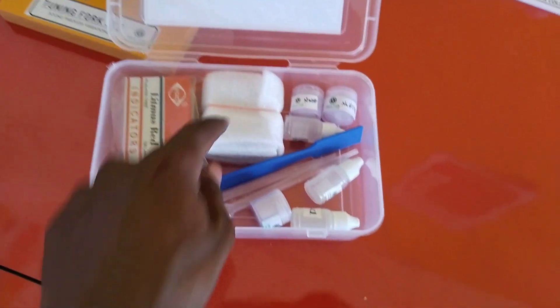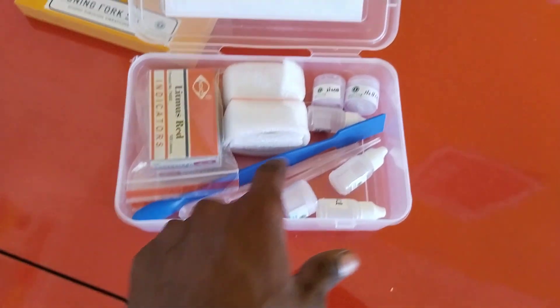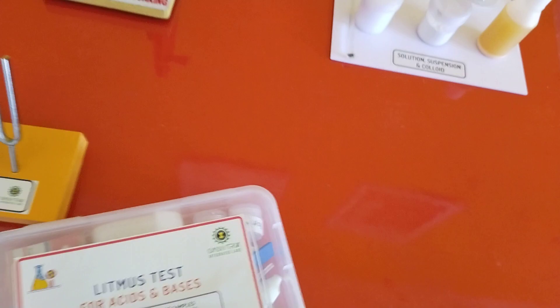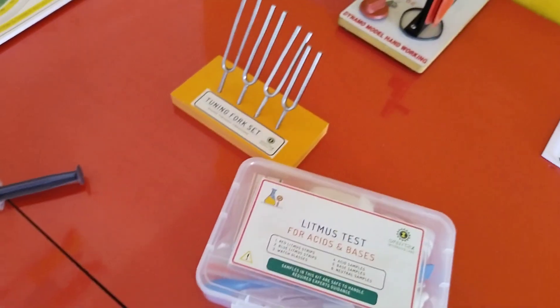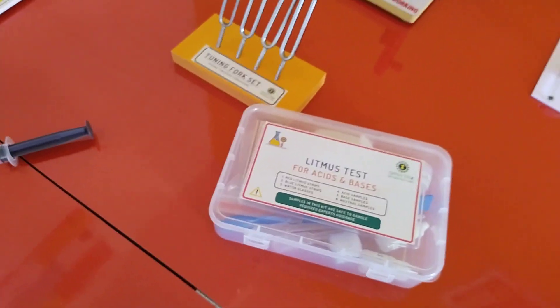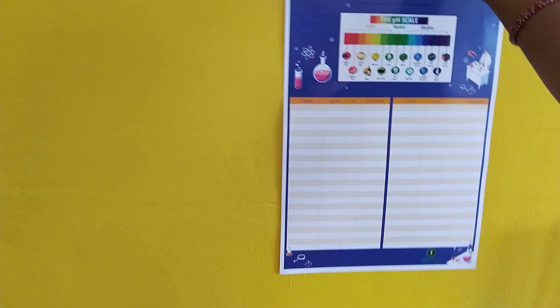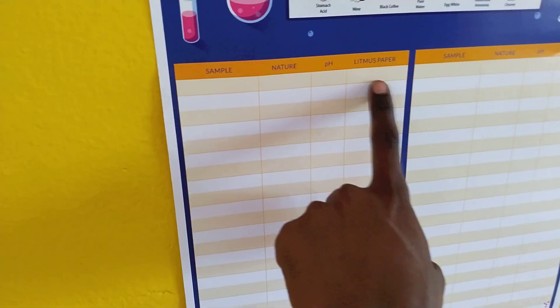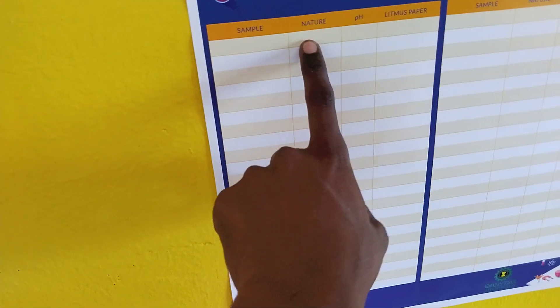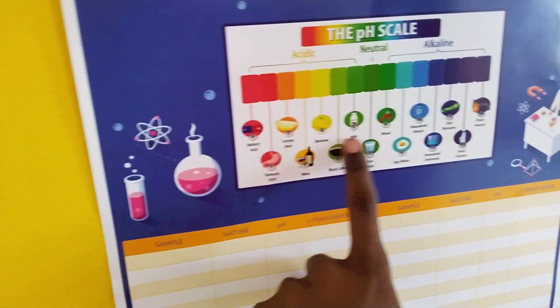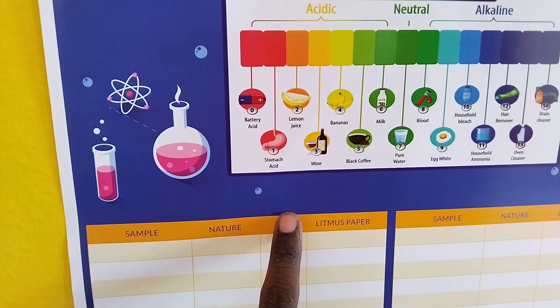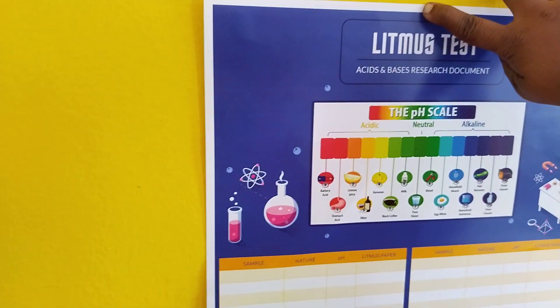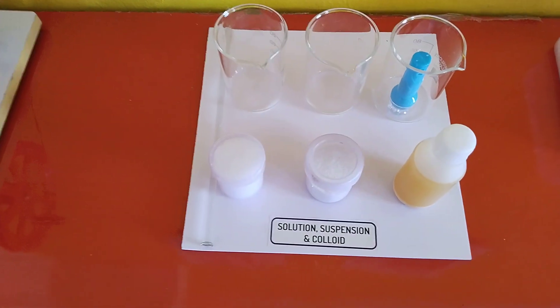We have watch glasses where we can take samples using droppers or a spatula. That's how we test acids and bases. We paste the results in the litmus chart. When we do the litmus strip test, the blue strips are glued over here. We take a sample like HCl — its nature is acidic — and we can read the pH value from this table. We paste the litmus strip here, and that's how we get a number of litmus strips recorded on this litmus chart.